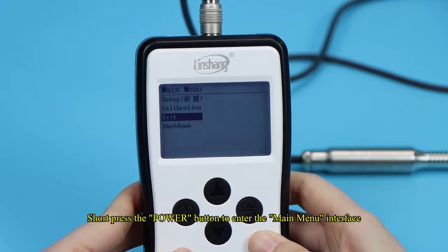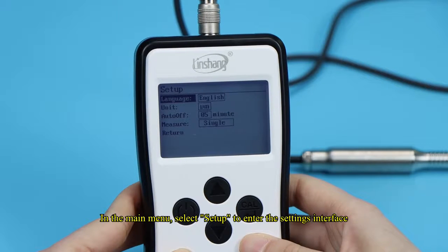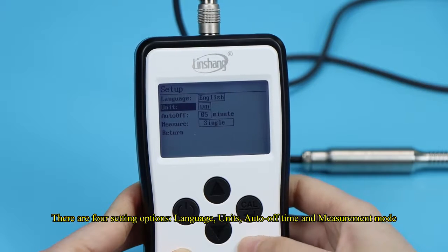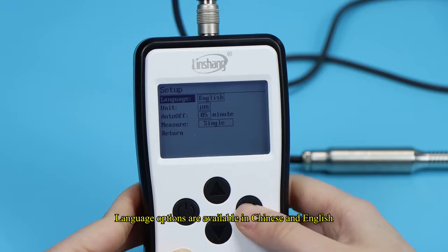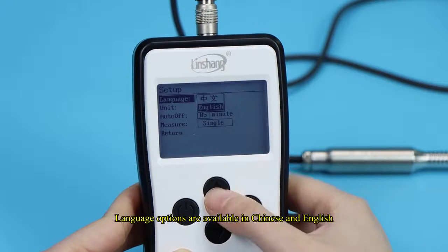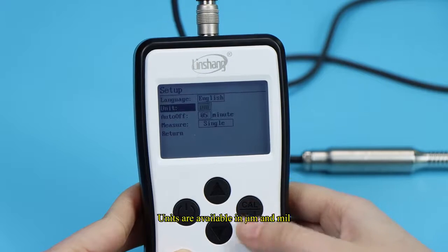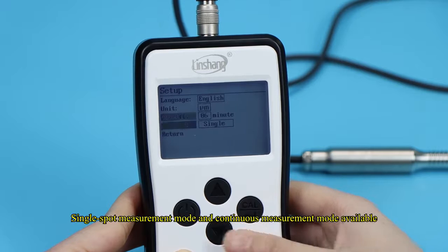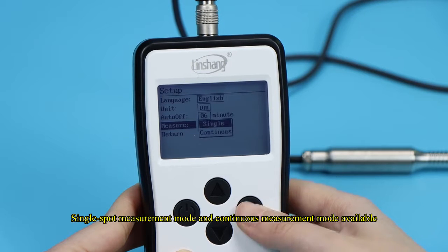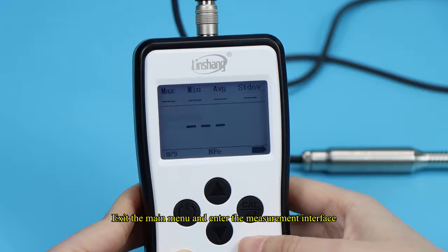Short press the power button to enter the main menu interface. In the main menu, select Settings to enter the settings interface. There are four setting options: language, units, auto-off time, and measurement mode. Language options are available in Chinese and English — press the up and down flip buttons to select, and the back button for confirmation. Units are available in µm and MIL. Automatic switch-off time can be freely set from 1 to 9 minutes. Single spot measurement mode and continuous measurement mode are available. Select the back button when finished to exit the main menu and enter the measurement interface.